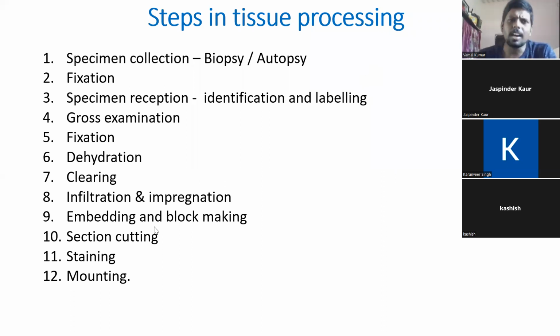Yes, students. Next, we have fixation. Fixation we already know. Here we will denature the proteins and make crosslinks among the proteins, so the tissue becomes hard. Upon this, we will go to the next step.